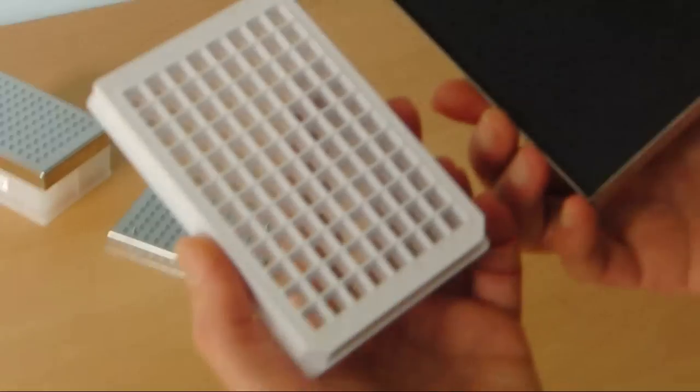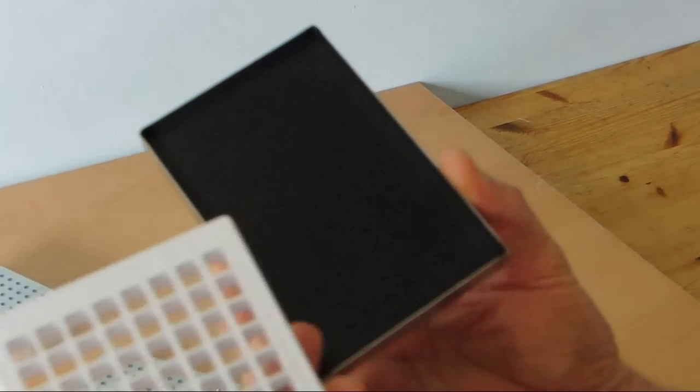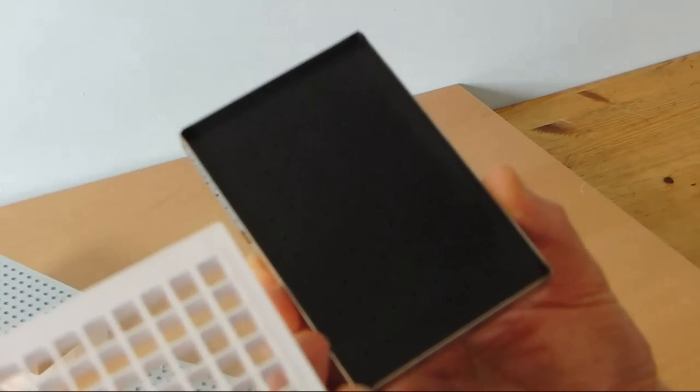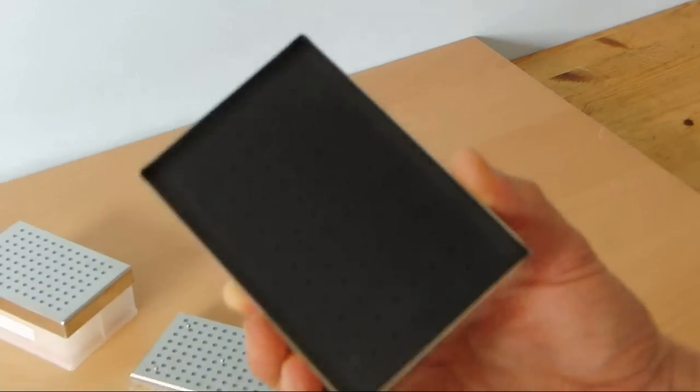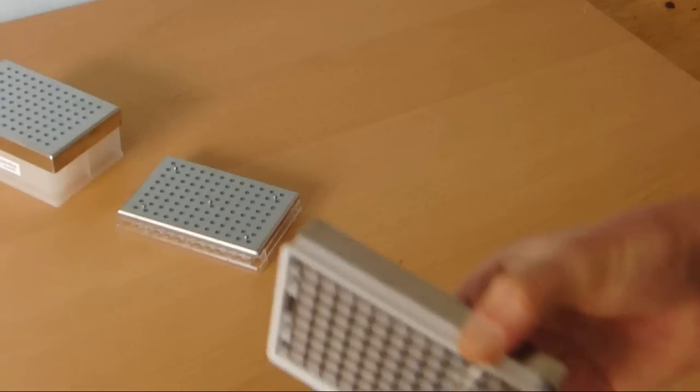For low square well microtiter plates and for other types of plates that do not have open spaces between the wells to accommodate the positioning pins, we have universal covers, as shown here.